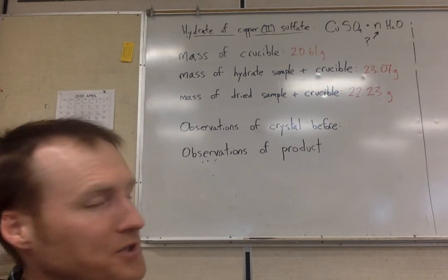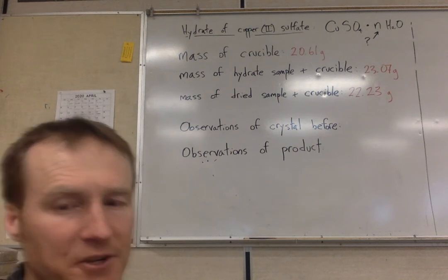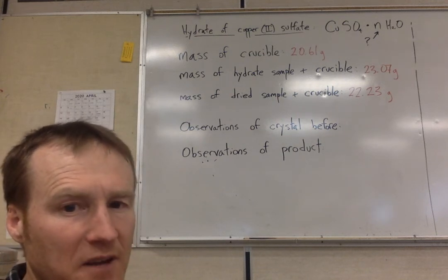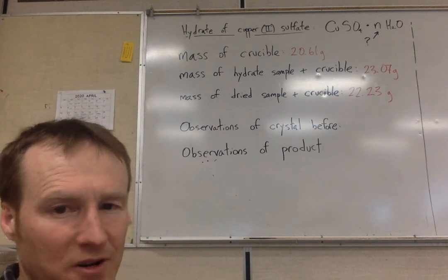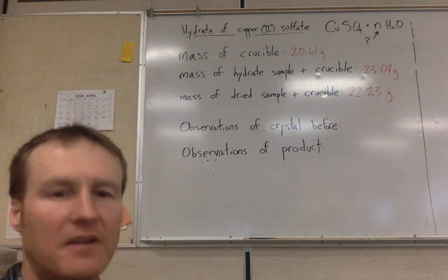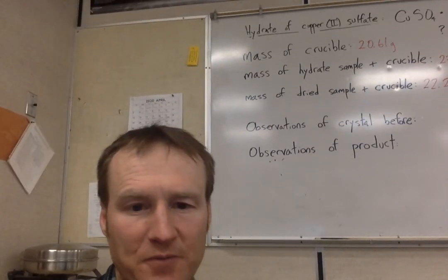I don't know what the result's going to be for this lab. After you're done the lab, you're welcome to look up what the common hydrates are for copper sulfate. But as it is, I'm not going to tell you. I'm just going to say do the calculations, and see what you find. I hope that helps for this lab.